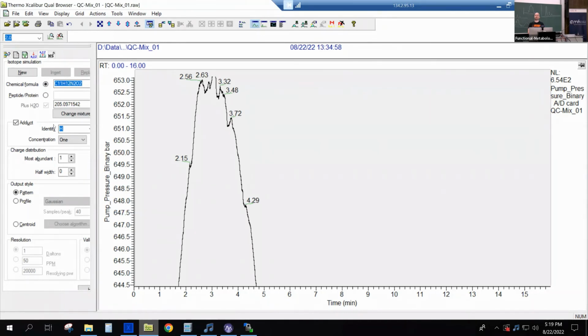Oh yeah, we use pre-columns, but also, I read in one paper that pre-columns are not... Oh really? Okay, interesting. I don't know. I mean, we simply do it for economic reasons, right? Because changing the full columns, we use Phenomenex Kinetex, and they're like $800 per column, right?